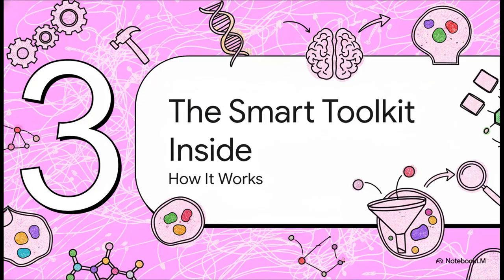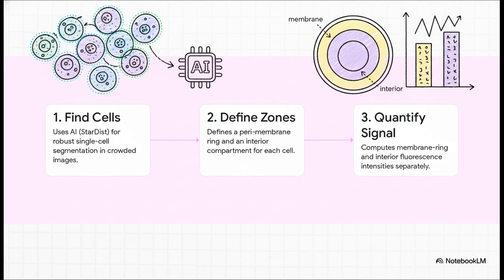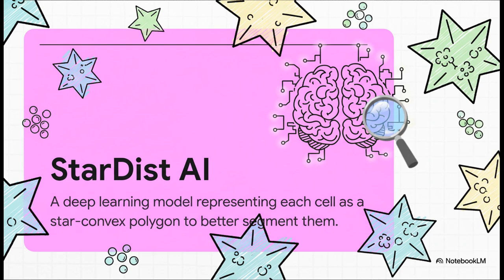So how does this thing actually work its magic? It's all about the very clever toolkit it has under the hood. Let's break it down. It's basically a three-step process. First step, it uses some slick AI to find and trace the exact outline of every single cell, even in a packed crowd. Second, for each of those cells, it automatically draws two distinct zones, a skinny little ring around the edge for the membrane, and then all the space inside that ring, the interior. And finally, it gets the real numbers, accurately measuring how much of that fluorescent glow is in each of those two zones.